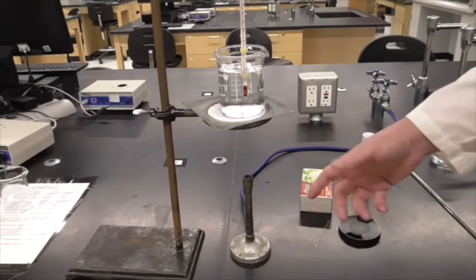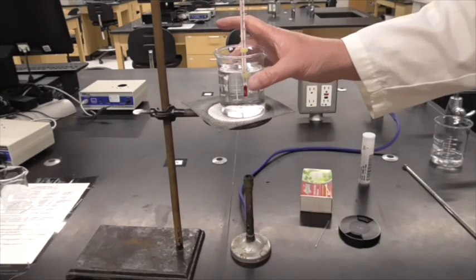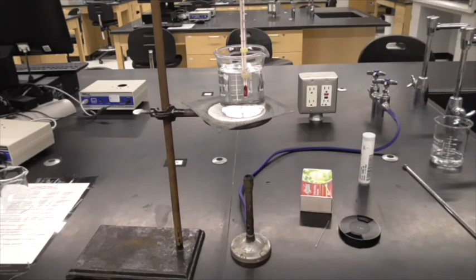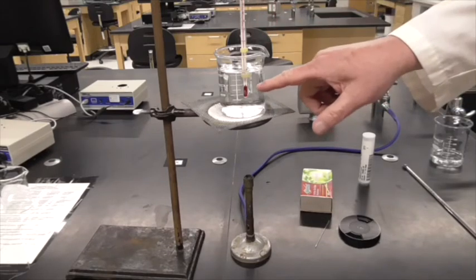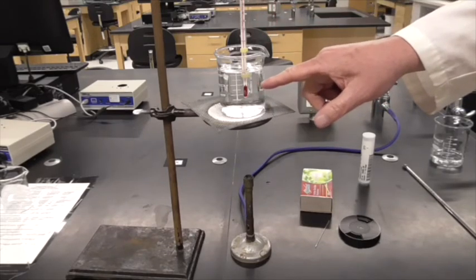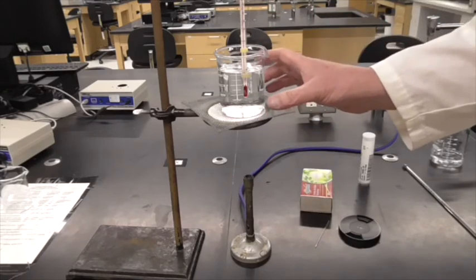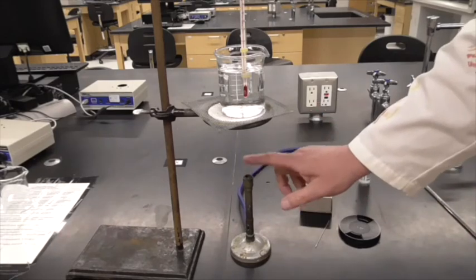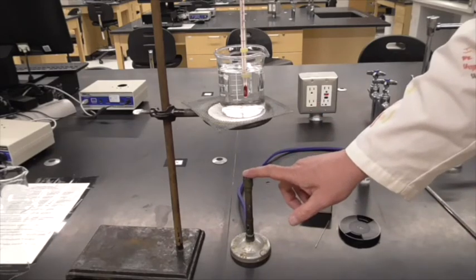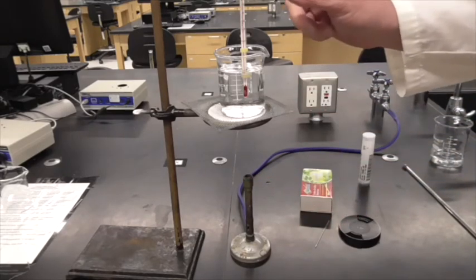Okay, what you can see we've done is we got our Bunsen burner ready to go. We have our water bath ready to go. Our sample is attached to our thermometer and it's in the water bath. You can see that it's not touching the bottom or the sides of the glass. It's completely in the water, kind of right in the middle of the water bath. So now we're going to heat the water using the Bunsen burner, and we're going to watch the temperature go up.